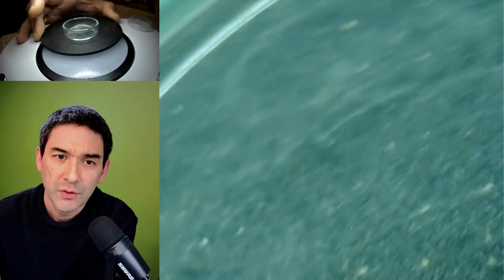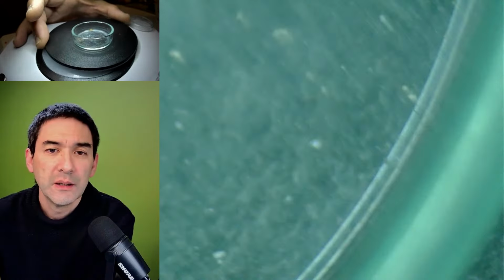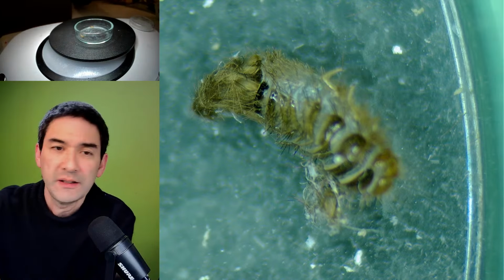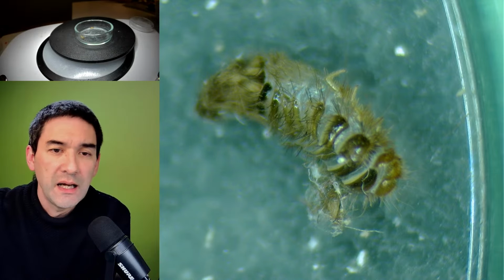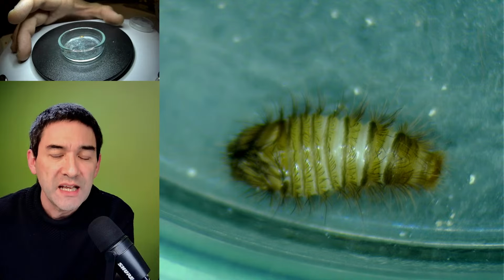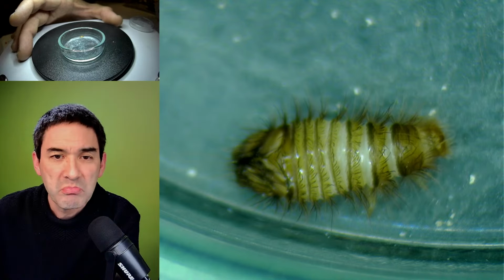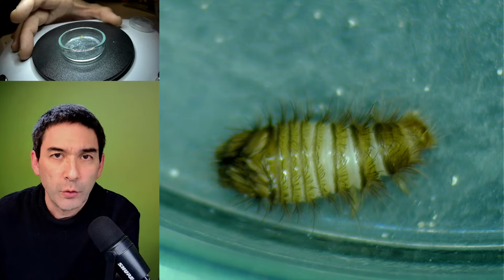And over here, I need to maybe zoom out a little bit. This one over here is the skin of the carpet beetle. It molted because as it grows, it starts to shed its skin. What I'm going to do now is keep on watching it, because this one seems to be the larva stage, and it should basically metamorphose into the adult form sometime.